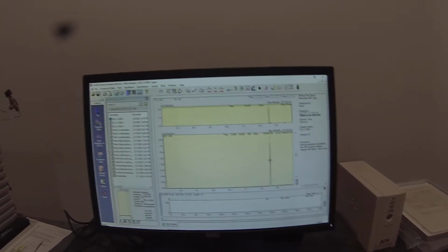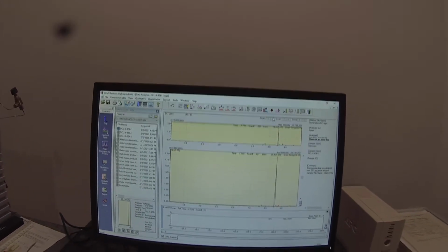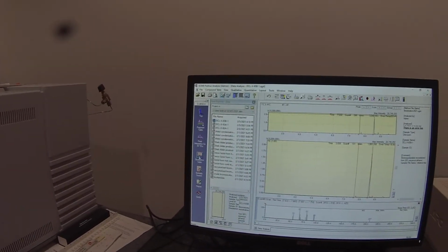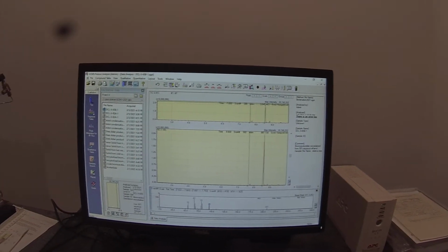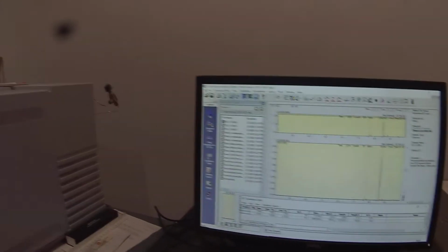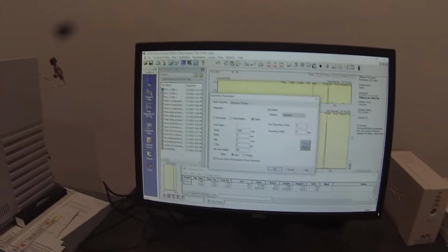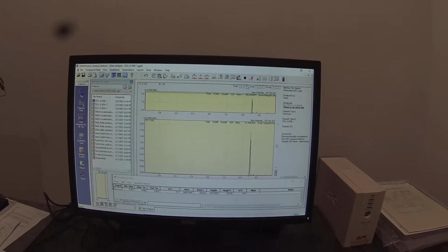And you'll notice this one only has that one peak, so I'm going to integrate it. Again, it's picking up a little tiny peak here, which we probably don't want. Right? And if I look at the qualitative table, that's only 0.32% of the area. It's not clear what it is. 207 isn't the molecular weight that rings the bell here. So that only has an area of about 111,000. If I set this minimum area to 200,000, that'll make that peak go away, so that I'm just seeing the one significant peak.